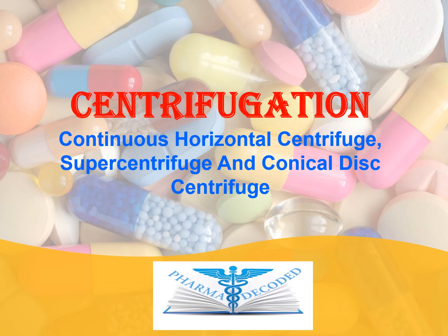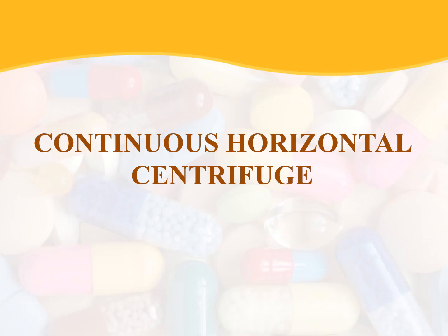Hello everyone, now let us discuss part 3 of centrifugation. Here we will be discussing the continuous horizontal centrifuge, supercentrifuge and conical disc centrifuge.